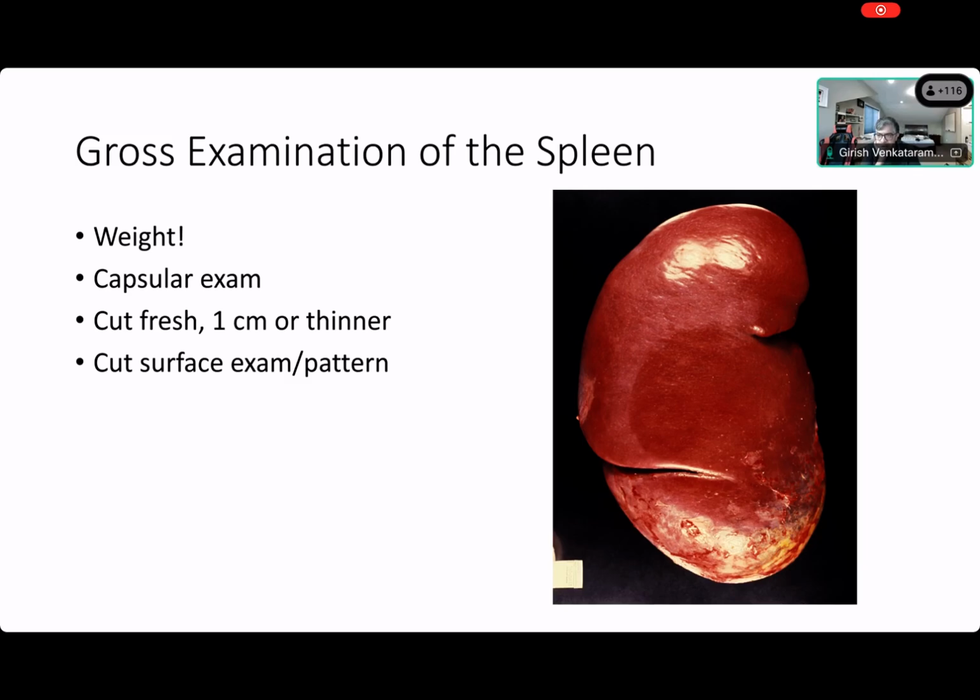So typically, when you see a splenectomy specimen, the weight is critical, right? The weight itself tells you a lot. Always look at the capsule and make sure you've got thin sections because it just won't fix easily. Look at the cut surface and examine the pattern, especially when there's amyloid involving the spleen. There's a very characteristic look to it. So it's not a bad idea to look for focal lesions and diffuse lesions. You can have two different kinds of things, right?